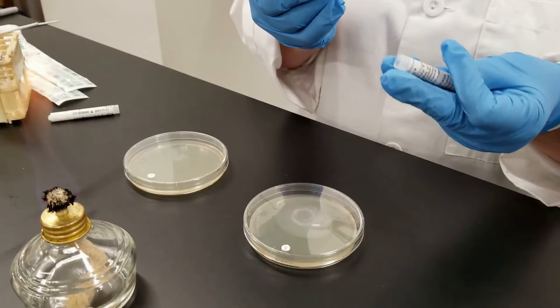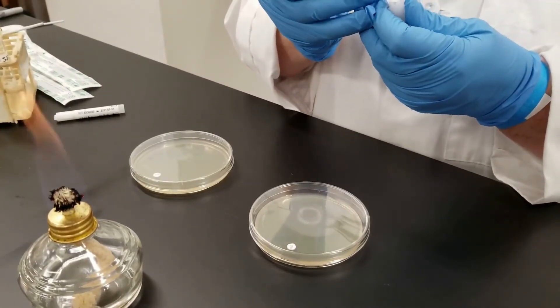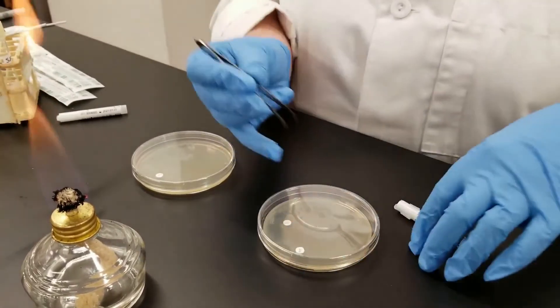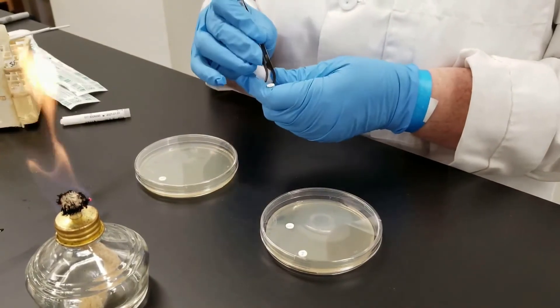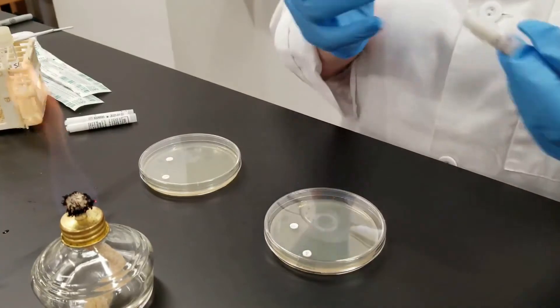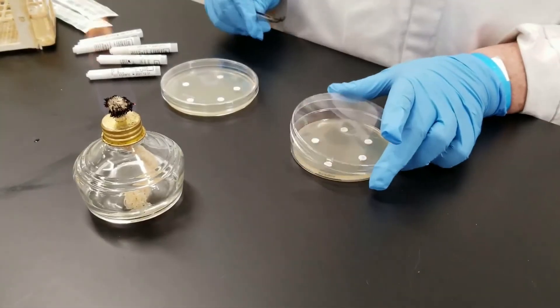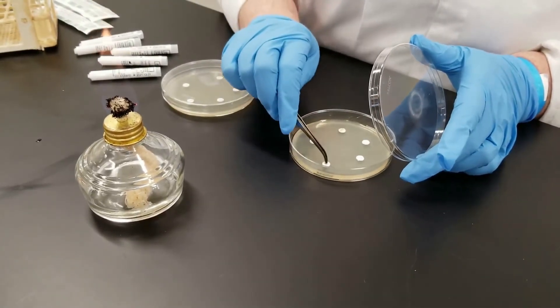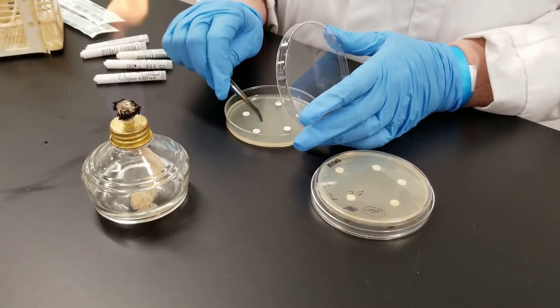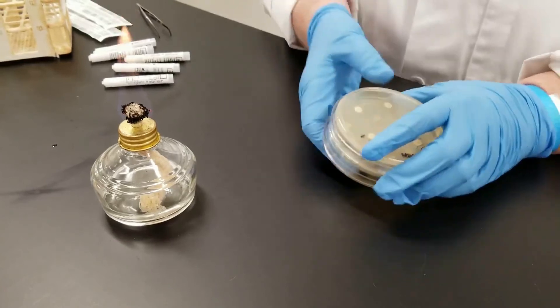Like this one says 15 on it, usually referring to micrograms. You're going to put it on the plate and just gently tap it — don't smush it down, just gently tap. We're going to use the same antibiotics on each plate so we can compare the gram-positive to the gram-negative. The antibiotic will diffuse out from the disc into the medium and will possibly inhibit the growth of the bacteria on that plate. You might want to gently tap so when you invert the plate they don't fall off. Then we will incubate these at 37 degrees.